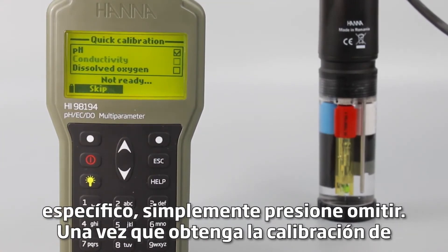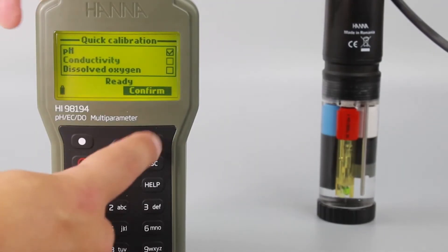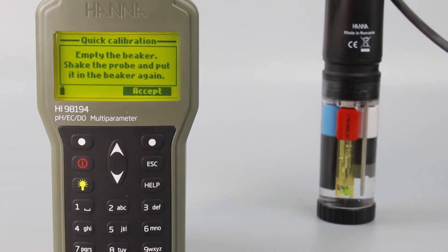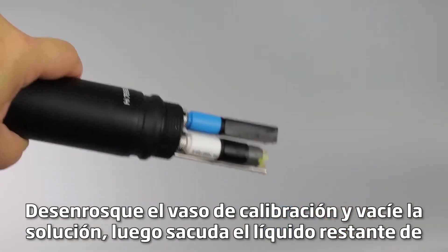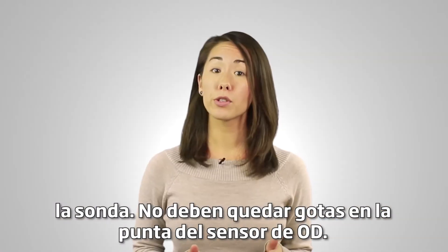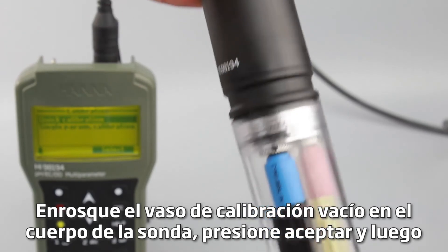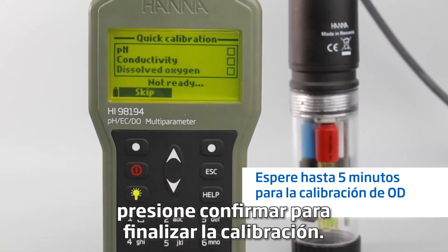Once you get to the dissolved oxygen calibration, you'll be prompted to empty the beaker. Unscrew the calibration beaker and empty the solution. Then shake any remaining liquid off the probe — no droplets should remain on the DO sensor tip. Screw the empty calibration beaker back onto the probe body, then press accept and confirm to finish calibration.